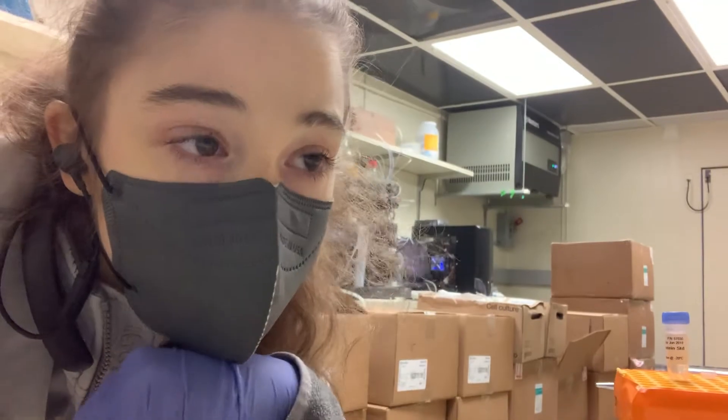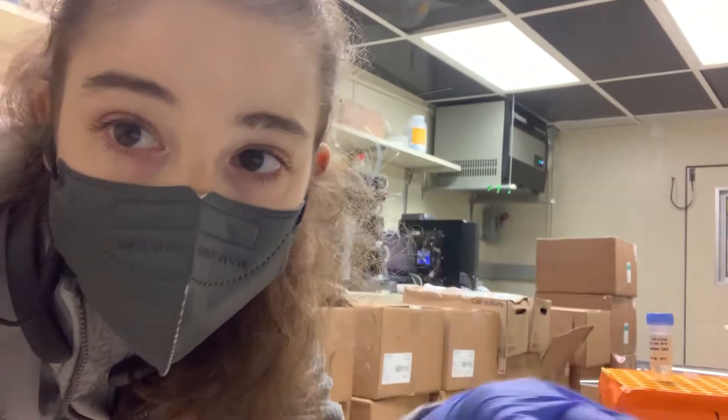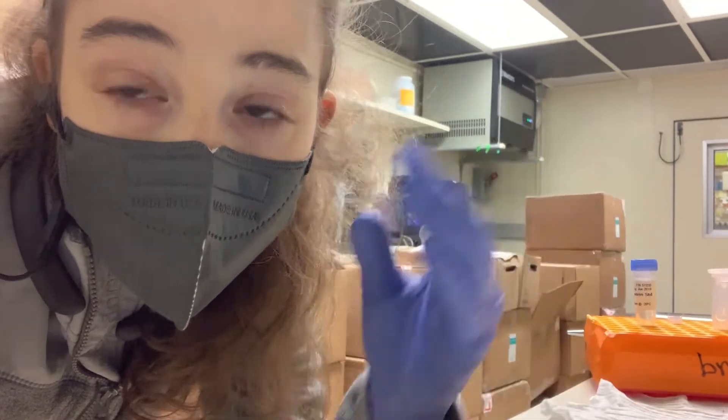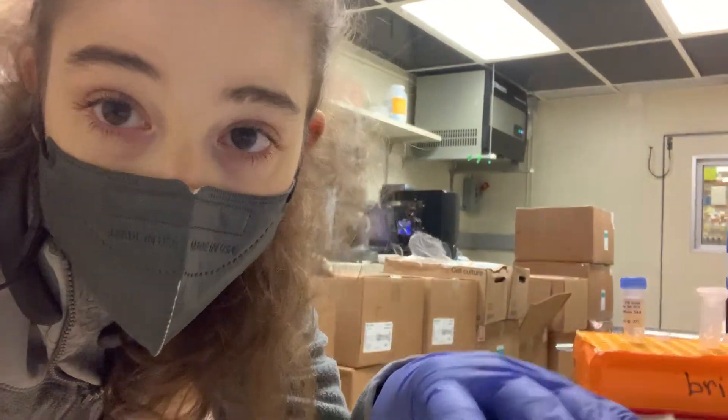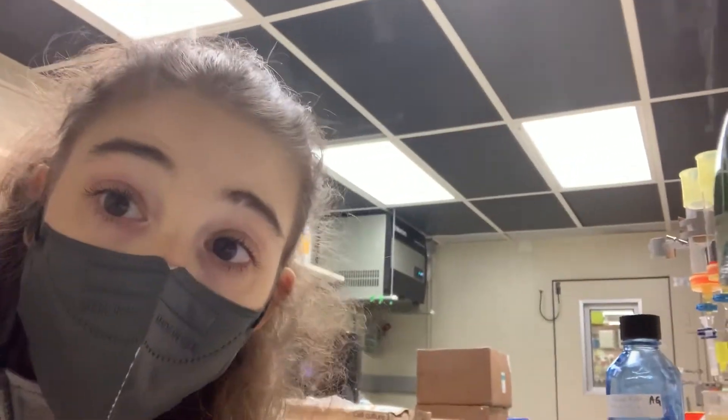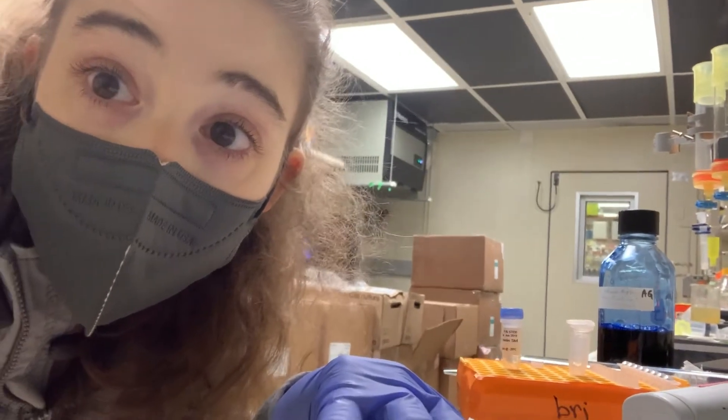Then I'm going to stop it, remove the inner buffer - so remove the blue stuff and put in just fresh non-dyed buffer. That's going to prevent it from getting over-dyed and causing problems. And right now I'm going to get out of the cold room.